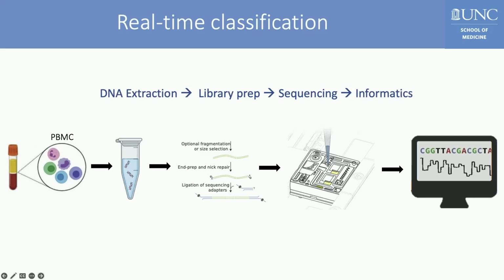So how long does this processing actually take? So the wet lab work, from grabbing the sample, running DNA extraction, and preparing the library, took about 3 hours. Most of that was for the DNA extraction. About an hour of that was for library preparation.